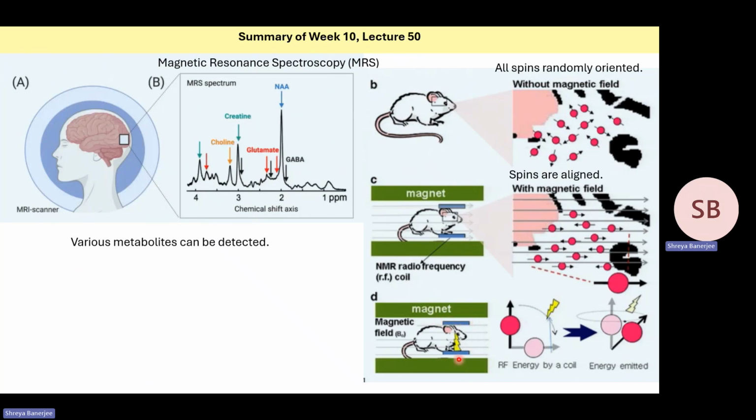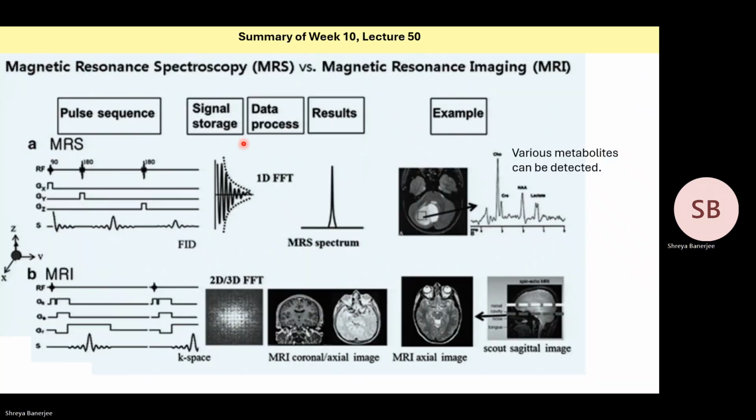And then at a resonance frequency, the nuclei will be promoted from the lower energy level to the upper energy level, and that will give you peaks in the spectra. So this is basically how in vivo NMR is done. In vivo NMR like this, even of the human brain, the human is placed into the MRI scanner. You can get this kind of NMR spectra, and then you can resolve it to find out what metabolites are there.